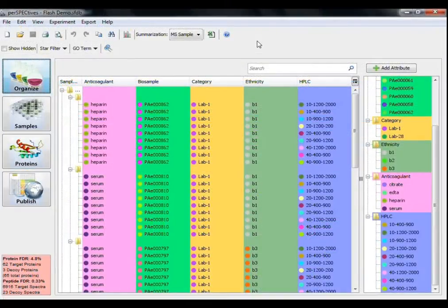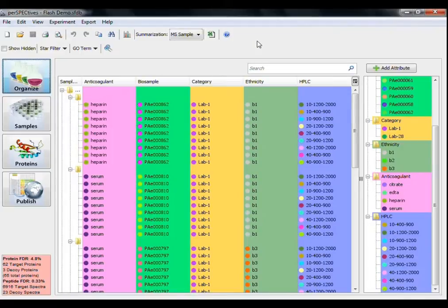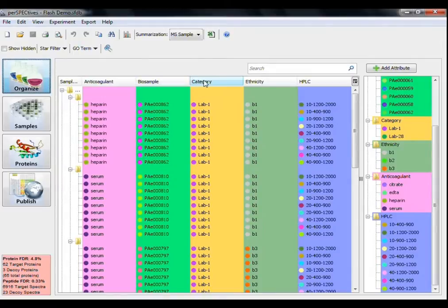This is the Organize view, which displays each MS sample and its assigned attributes. After loading an mzid file exported from Scaffold, Perspectives will automatically detect the biosample or category attributes defined in the other program.